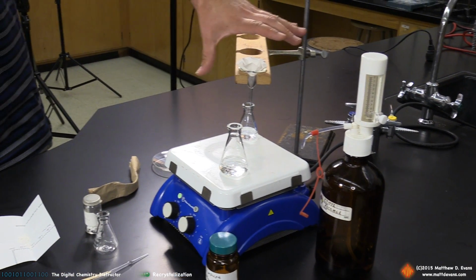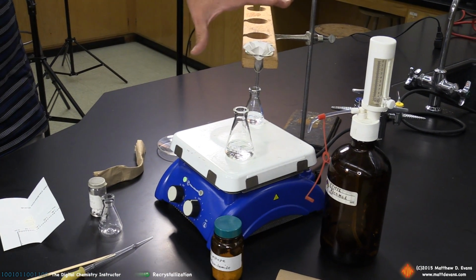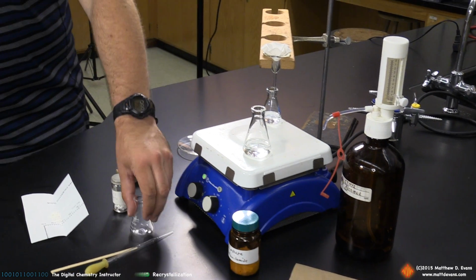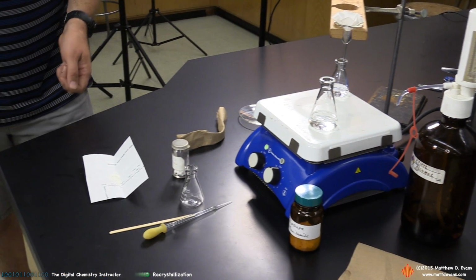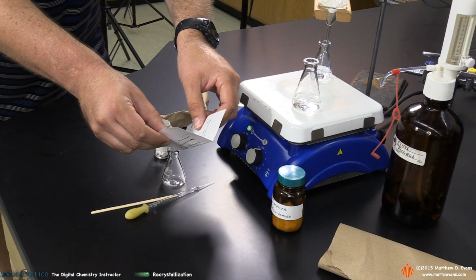But again, this is only used if you see that there are some solid impurities that simply will not dissolve no matter what you do. It's called a hot filtration. That's what you do. In the meantime, I've got my impure sulfanilamide and I've got another flask here. I'm just going to very carefully dump this impure sulfanilamide without spilling.